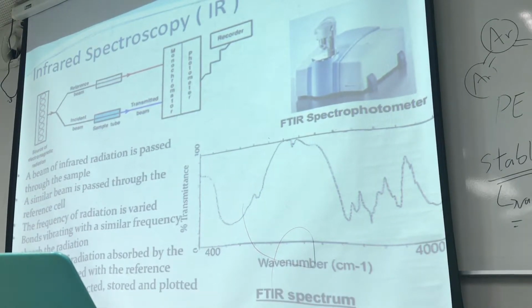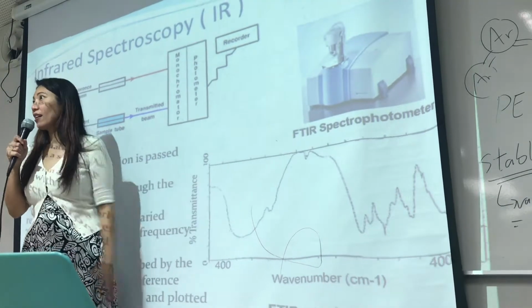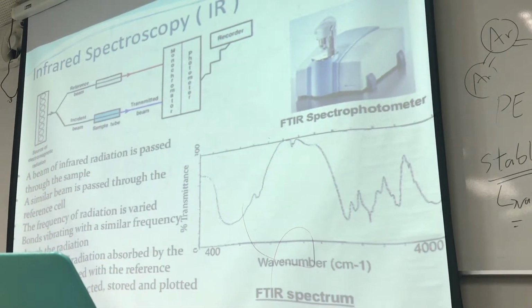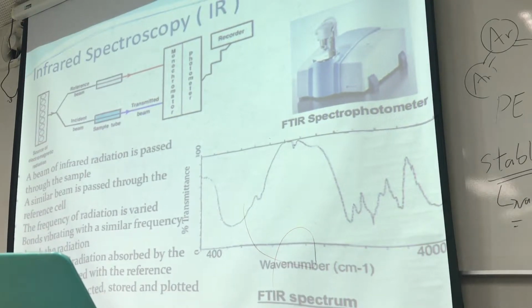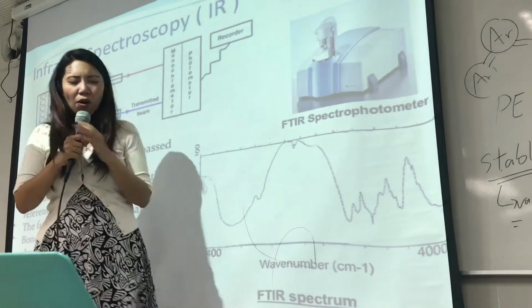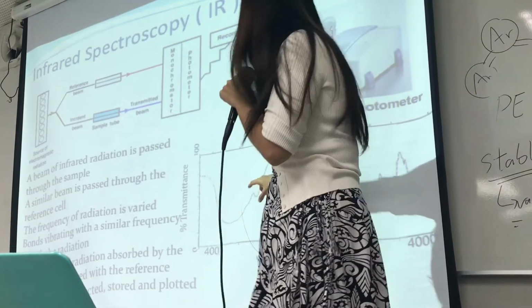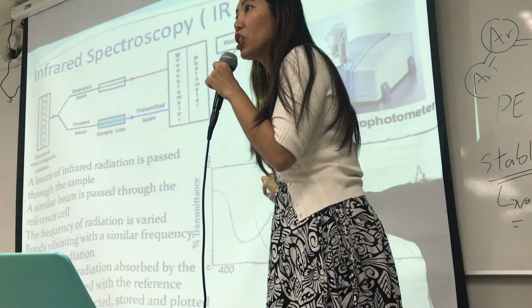So we know that at this frequency, there must be some kind of bonding. The sharp decrease of transmission means absorption that occurs from bonding. And here also there is a drop of transmission, which means a certain bond is absorbing some energy.